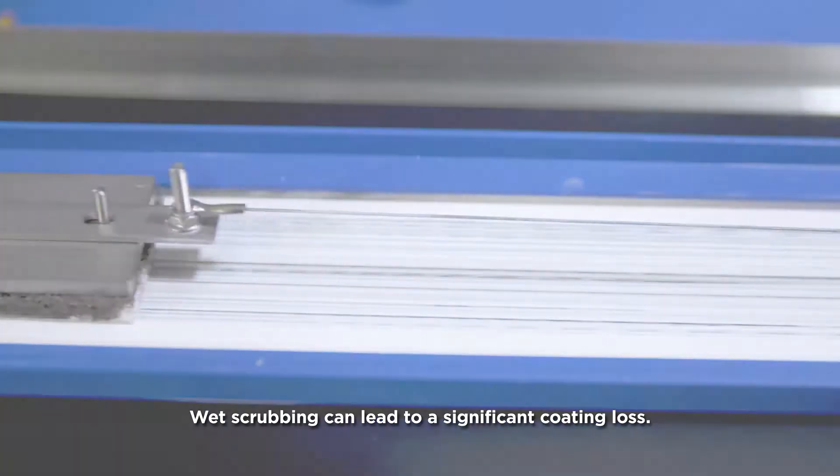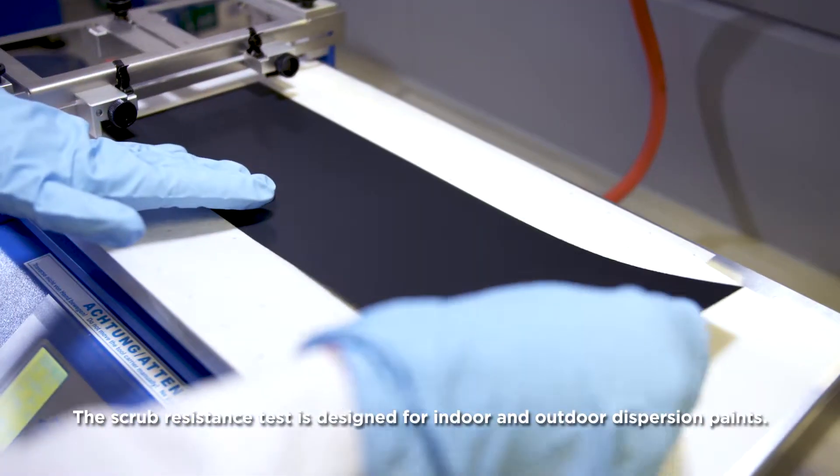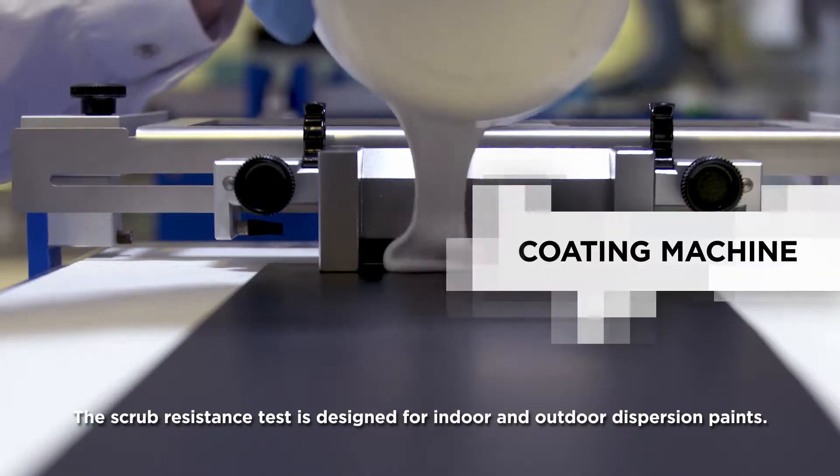Wet scrubbing can lead to a significant coating loss. The scrub resistance test is designed for indoor and outdoor dispersion paints.